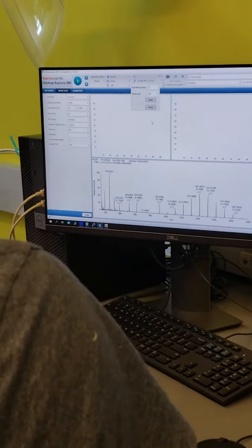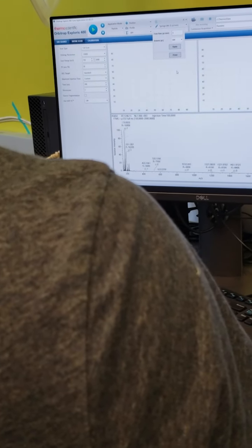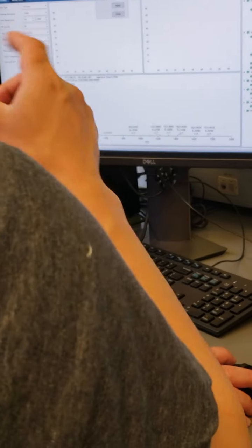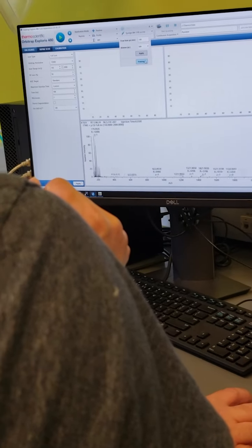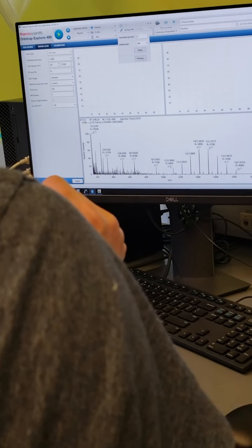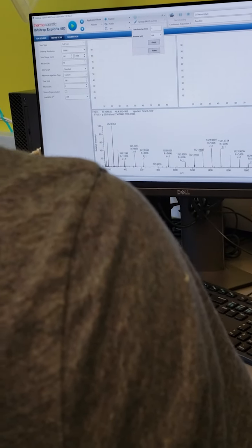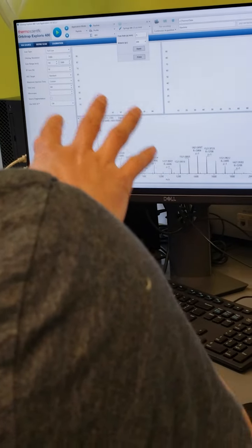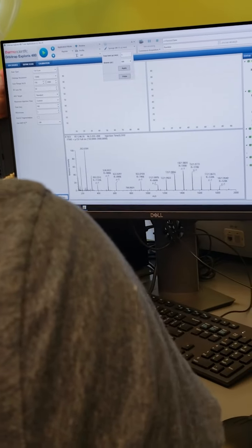All right, so to me, maybe we need to prime again now. Better? Back? Okay, I think good. It's good. Yeah, it's good. Because maybe that's left over from the previous time. Let it acquiesce. Yeah. All right, good.